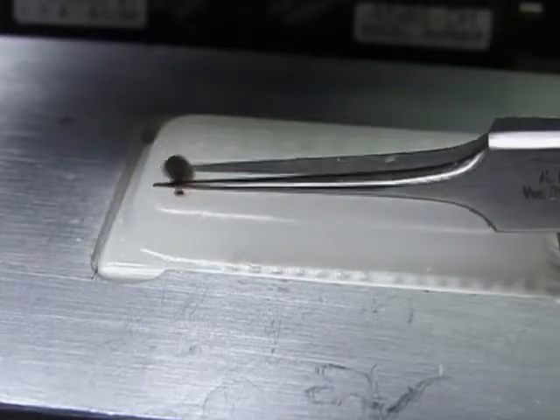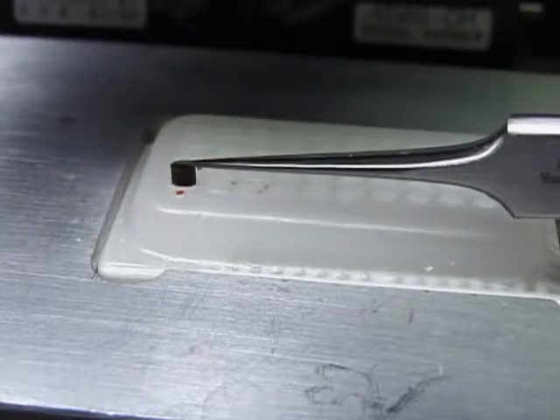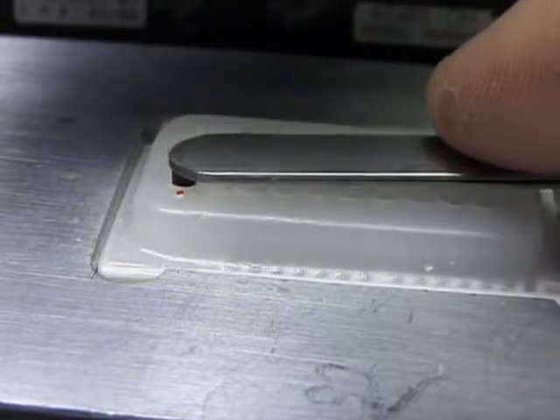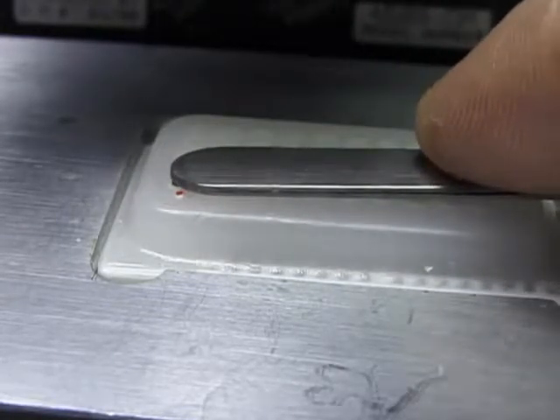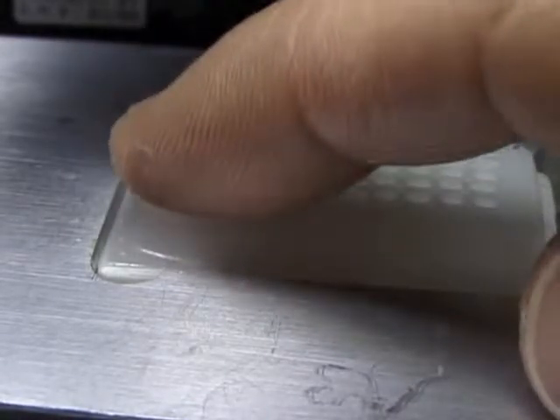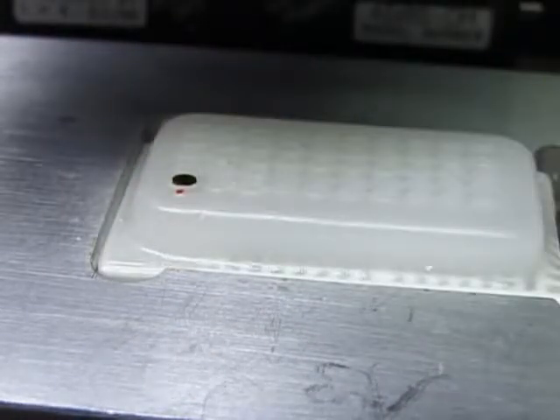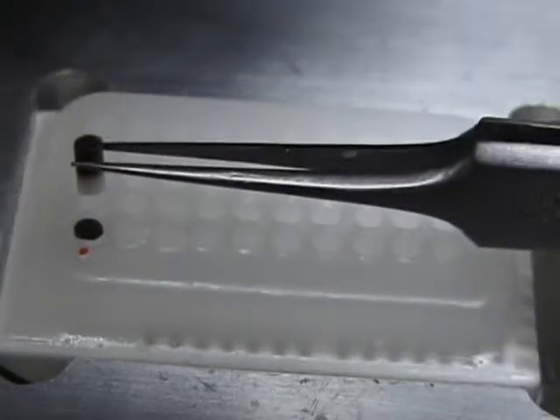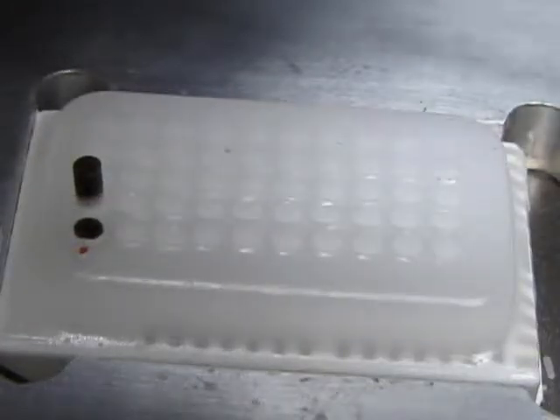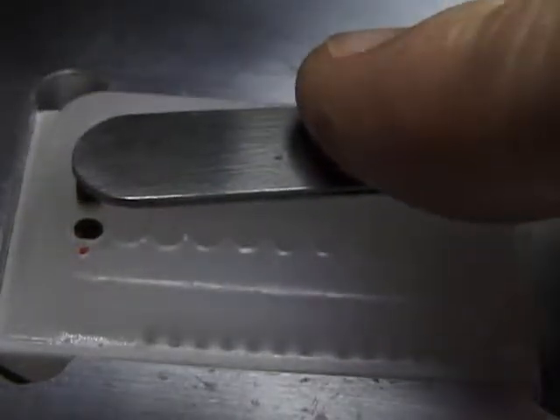To insert a punch, set the donor core on top of the hole with a pair of forceps. Then with the other end of the forceps, the flat side, press the core into the hole slowly. If you use the needle to insert the punch like the 0.6 millimeter needle, you will find that the 2 millimeter punch is not as flexible. If you are off center even slightly, the punch will scrape the side of the hole, damaging it.